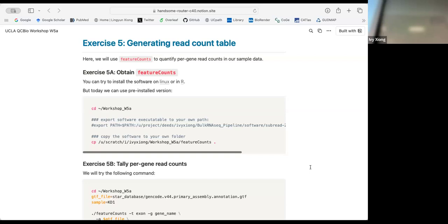Yeah, you don't need that one in there. Right, so now we're back to, and now we're in everything. So you move your first one, I'll be back. I see, just change. And then we can, so just like we're using the raw.